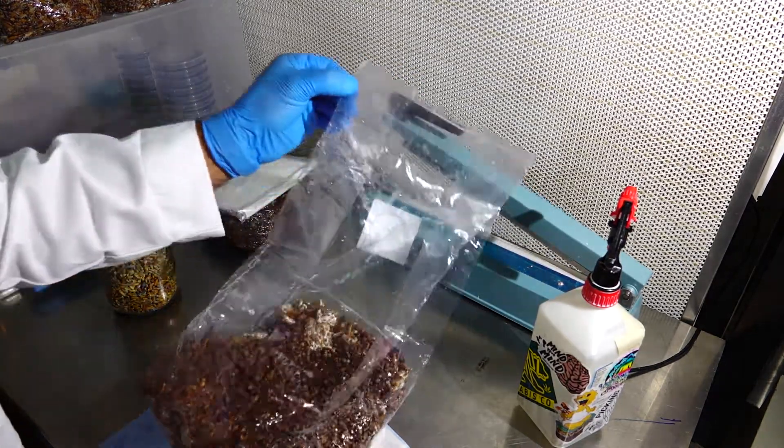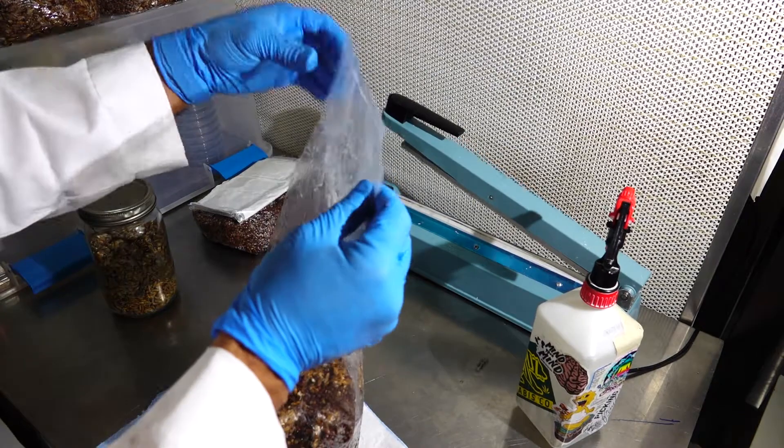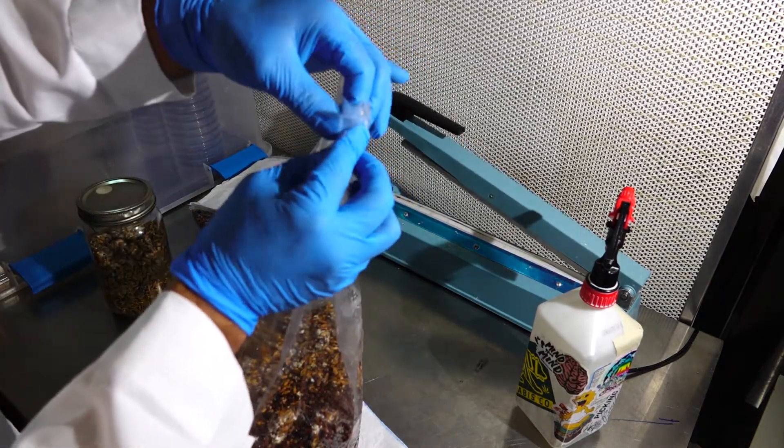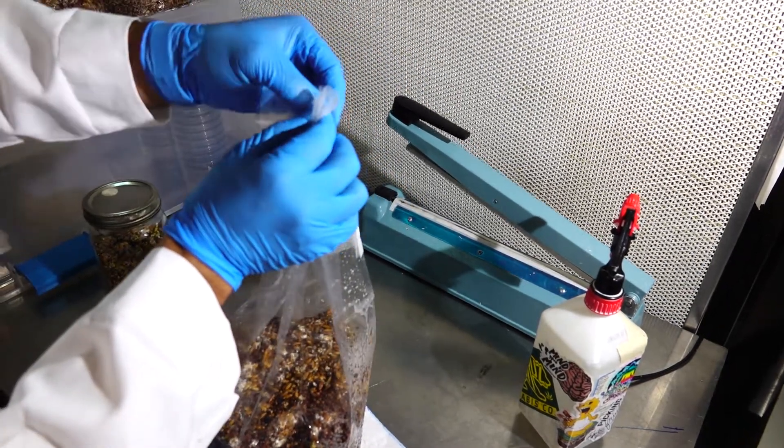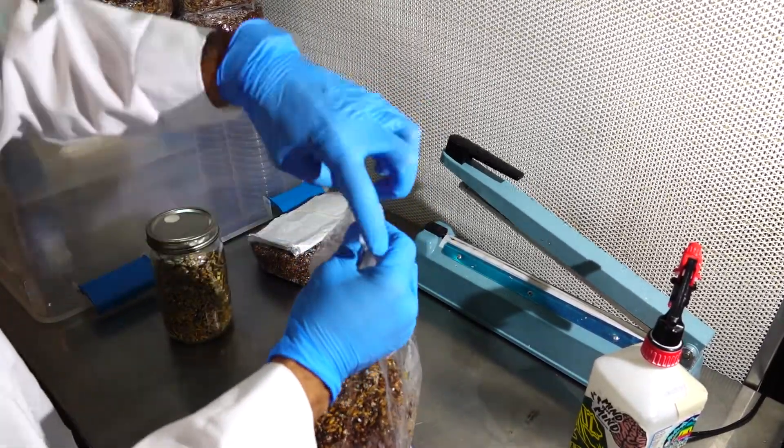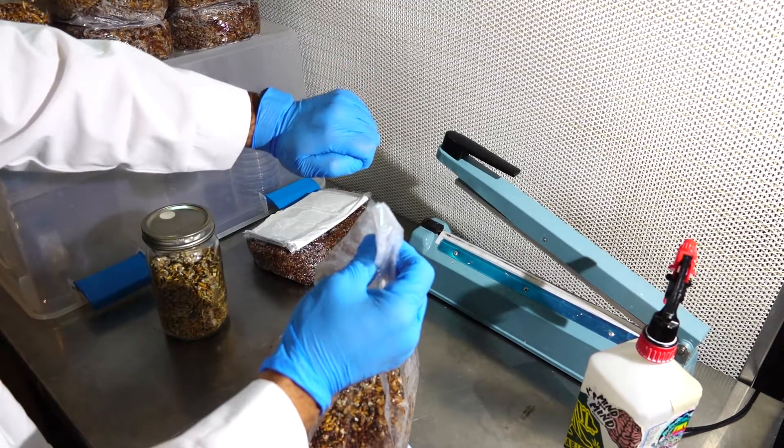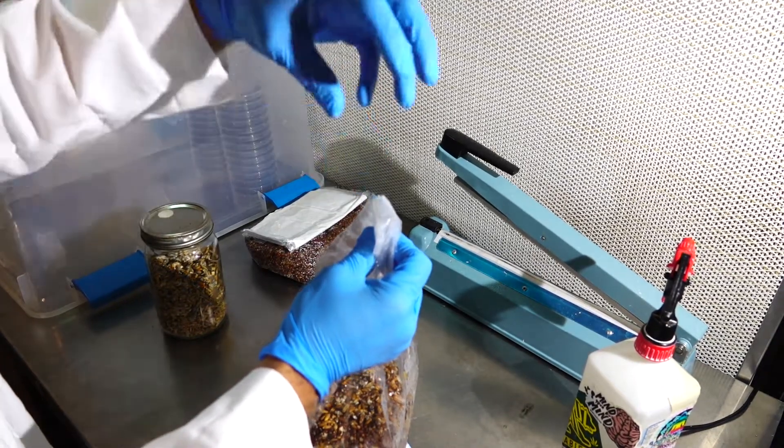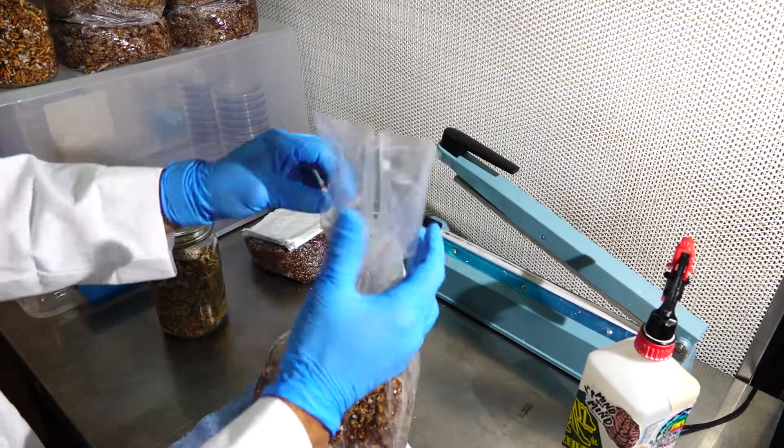If you don't have access to an impulse sealer, you can also use the accordion zip tie method where you would take the bag and you would accordion fold it, fold it over, and then put a zip tie and tie it down really tightly so that nothing can go inside of your bag after it's been transferred.